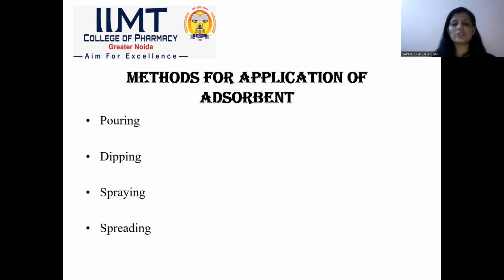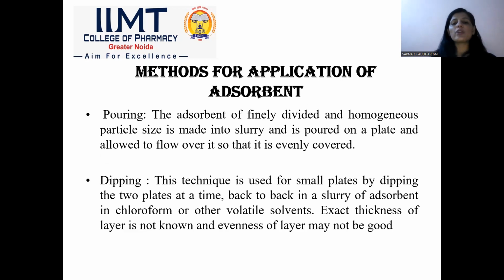Various methods are used for the application of adsorbents. First is pouring, then dipping, spraying, and spreading. In the pouring method, a homogeneous particle size slurry is poured onto the plate and allowed to flow over, so that the plate is evenly covered with the slurry.